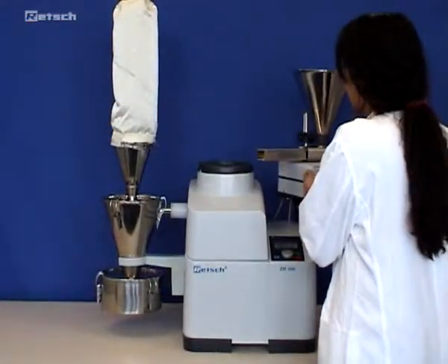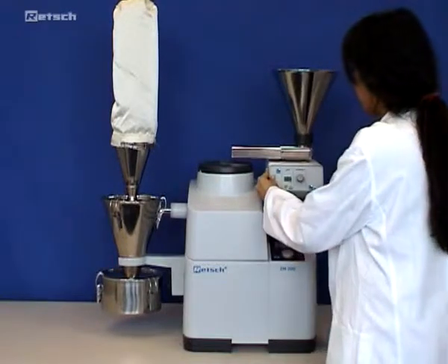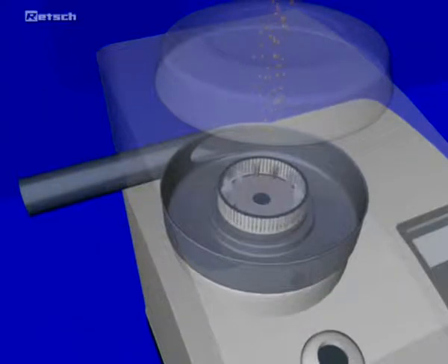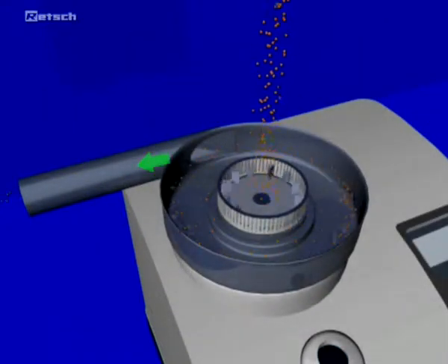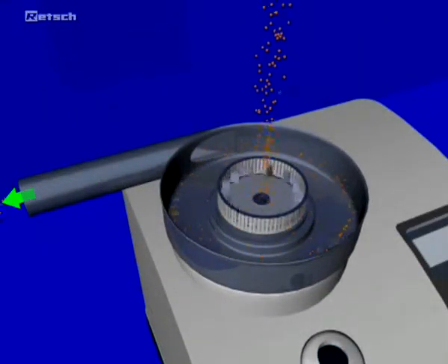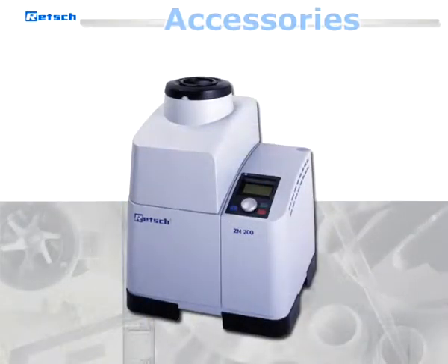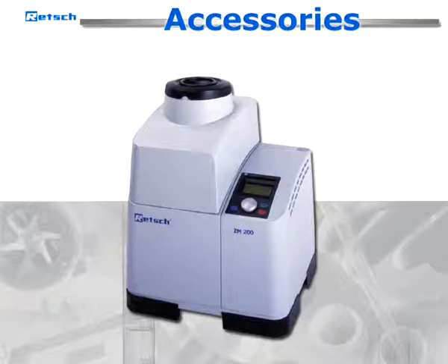Moreover, for grinding larger volumes or samples that are sensitive to heat, we recommend the use of cyclones. The airflow generates a cooling effect and discharges the sample more quickly from the grinding chamber. Furthermore, RETCH offers a wide range of accessories to suit the instrument to the variety of applications.